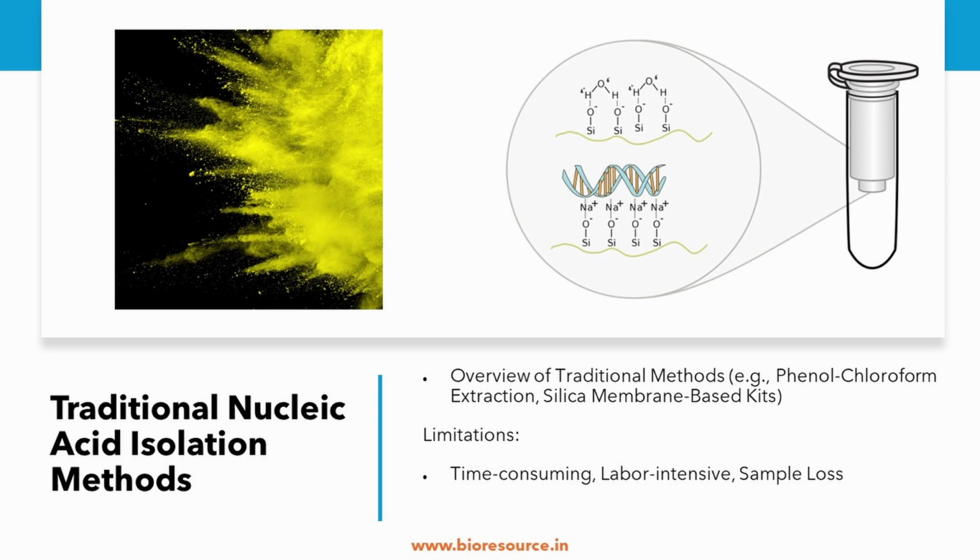Even though there are limitations, the traditional methods still have their place, and they can be particularly useful for getting high quality DNA. This gives a very good yield of highly pure DNA. Especially the silica column based methods are widely used in laboratories to yield high quality DNA.